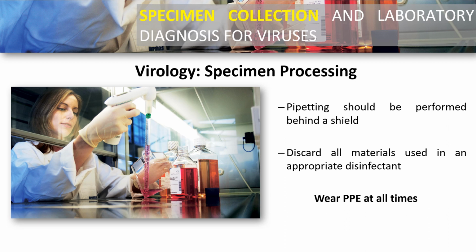So, pipetting should be performed behind the shield. Ito. Okay. And then, discard all materials used in an appropriate disinfectant. Then, wear PPE at all times, of course. Ito yung pinaka-basic, class. Hindi ka medtech kung hindi ka nag-wear ng PPE. Yan.